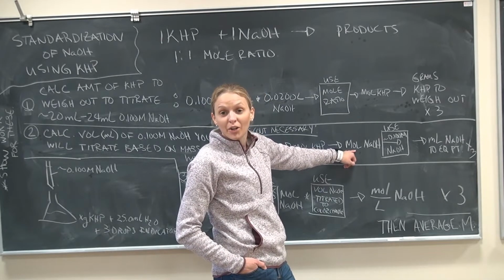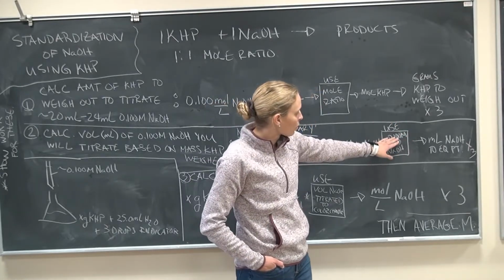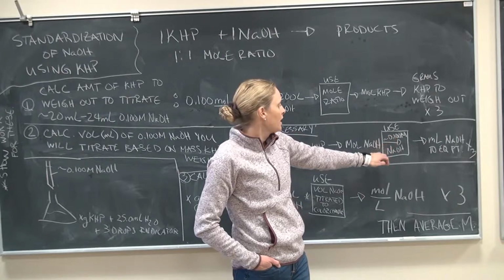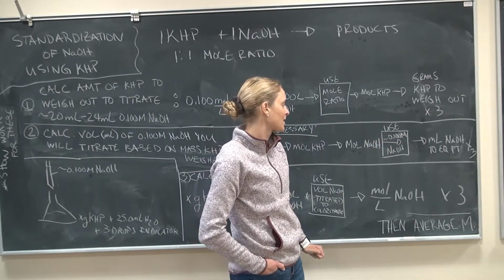Well, I can use molarity. Molarity has moles and volume in it. I can use the molarity, which should be approximately 0.1. So I'm going to get an approximate number for that.